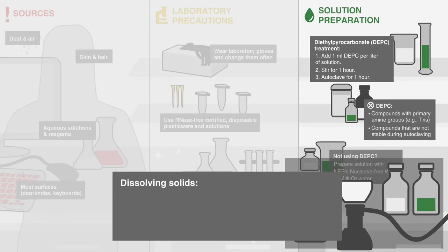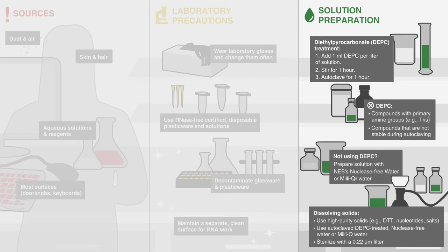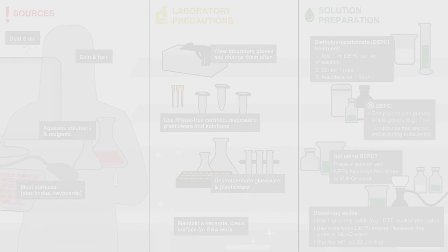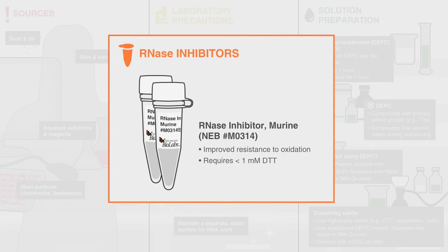Solutions and buffers — for example, DTT, nucleotides, salts — should be prepared by dissolving the solid and autoclaving in DEPC-treated, nuclease-free, or Milli-Q water, then passing through a 0.22 micron filter to sterilize. RNase activity can also be avoided by using RNase inhibitors, such as murine RNase inhibitor, which requires a low concentration of DTT — less than one millimolar — to maintain activity, making it ideal for reactions where low DTT concentration is required, like real-time RT-PCR.